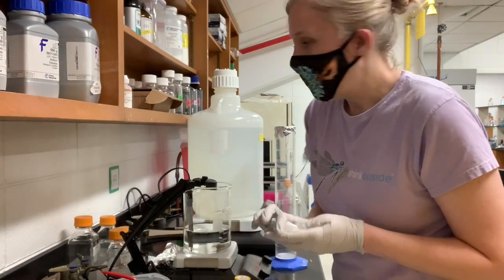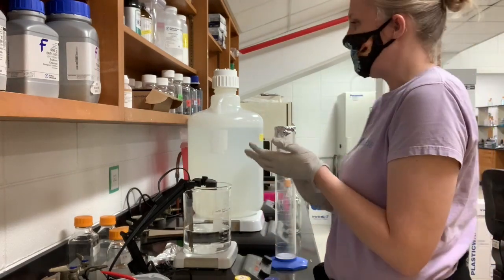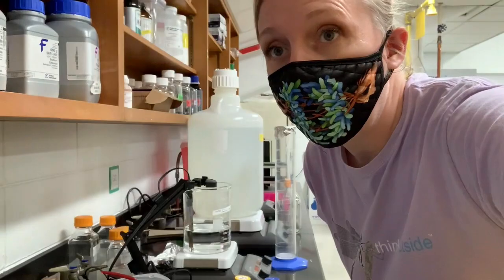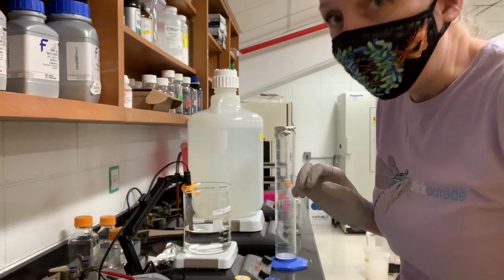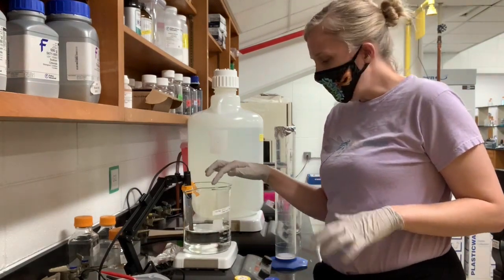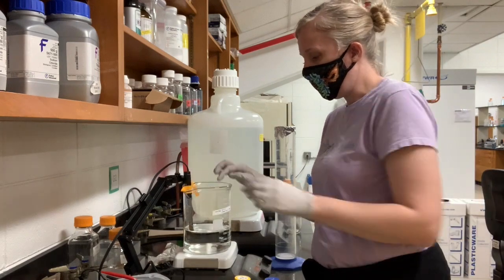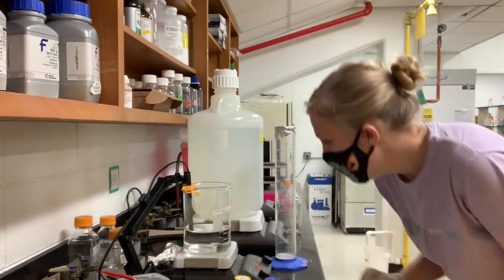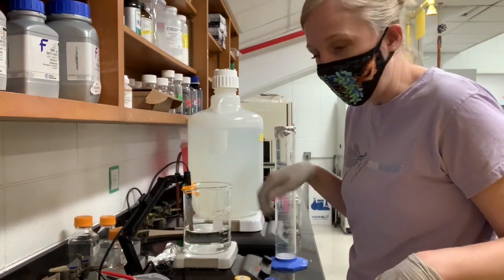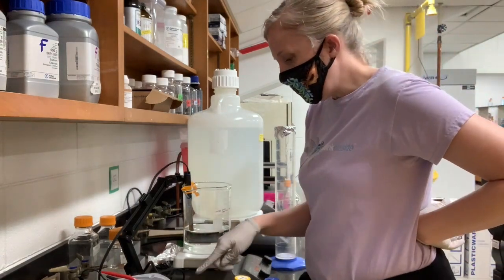I'm going to actually grab some tape to make sure that it doesn't come loose into the beaker. Okay, so I've now taped the meter, the probe, into the solution so that the probe is under the surface of the liquid but not near the stir bar. You don't want it to get banged around.